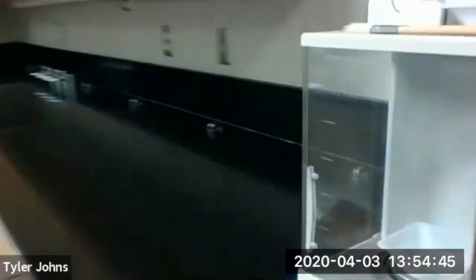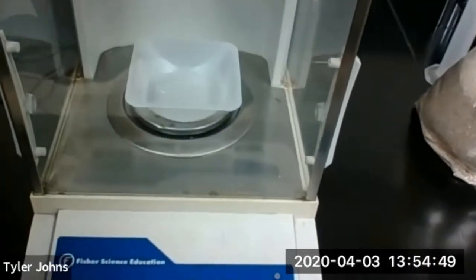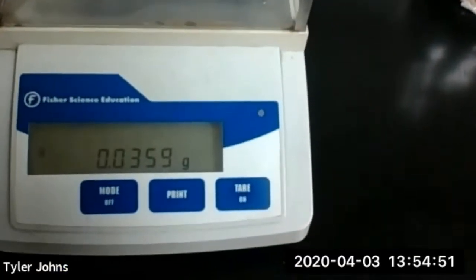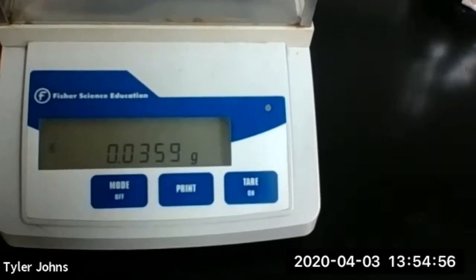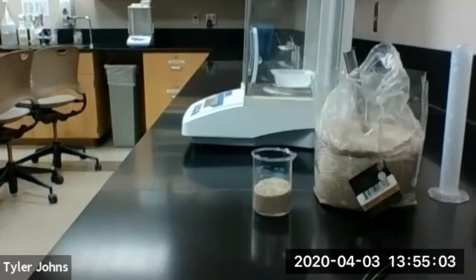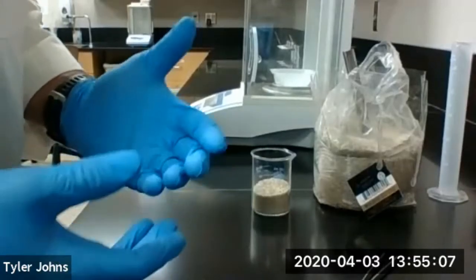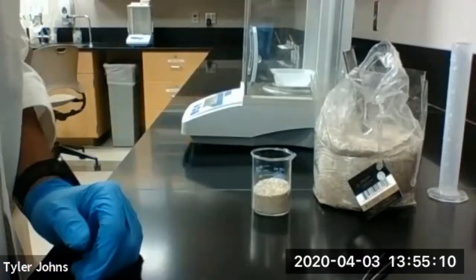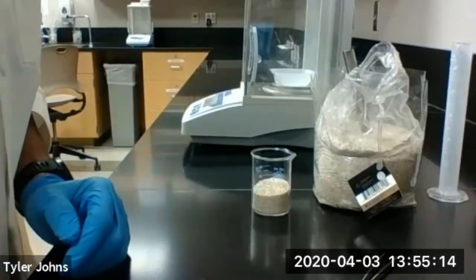So the mass of 20 grains of sand, here's our 20 grains of sand, is 0.0359 grams. So now you can calculate the approximate number of sand grains in the beaker and continue and finish part B of this experiment.